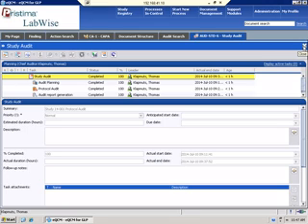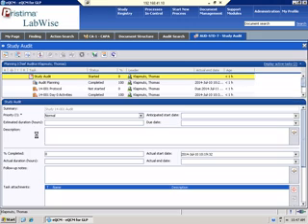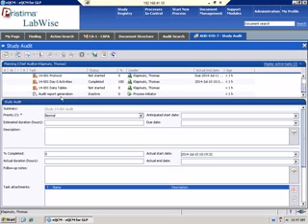When you generate a report, the system takes all the information and builds the report automatically. And so this one, I can't do my report until all of my tasks are done. And so once all of your tasks are 100%, the report generation will be sent out by email, and you'll be able to generate the report.